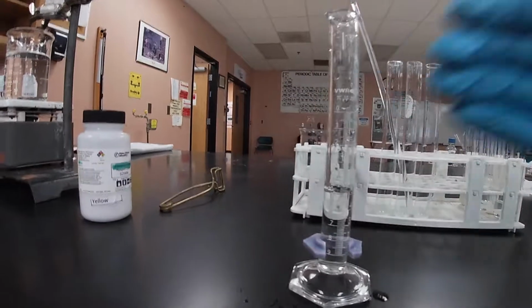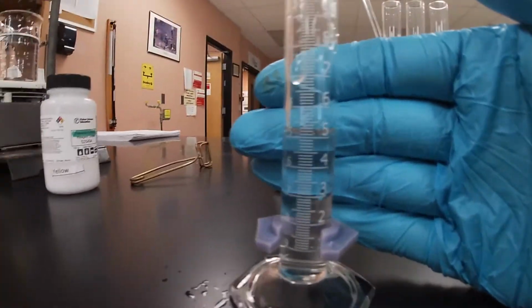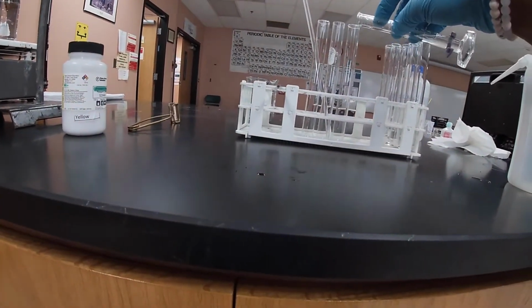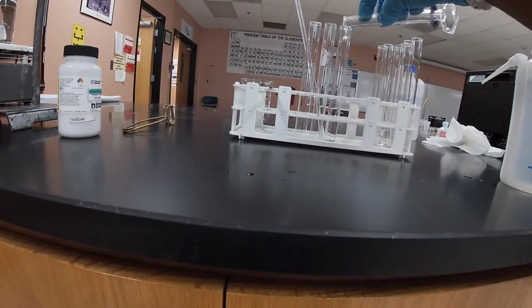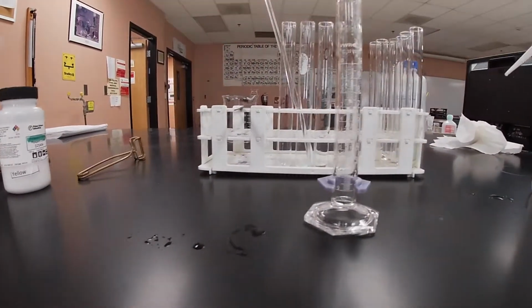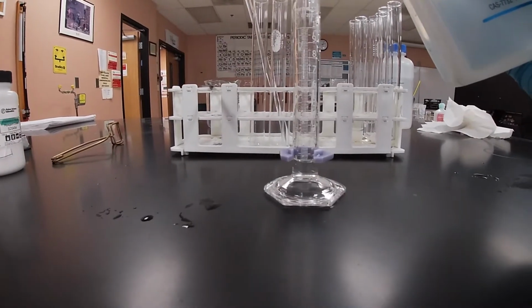And I think we should be good right there, right? Yeah, as you can see, hopefully you can measure, right? 5 milliliters. That'll be our first container. Okay, so that'll go into our first test tube. We're gonna do this again to add 5 milliliters to our second test tube.